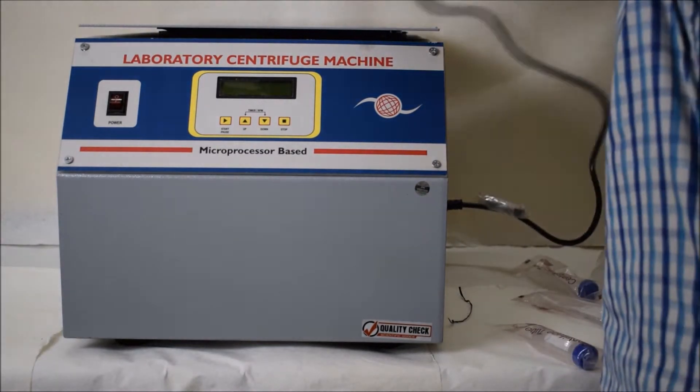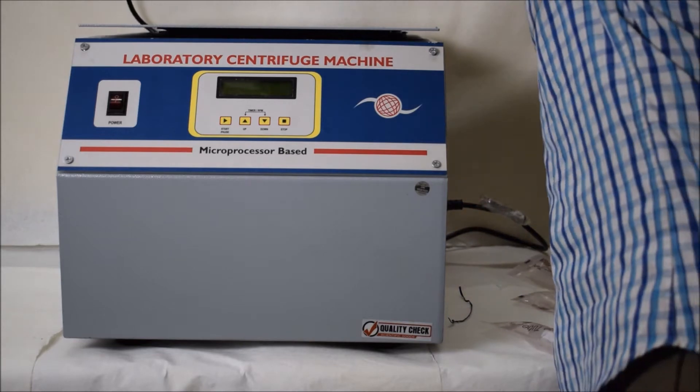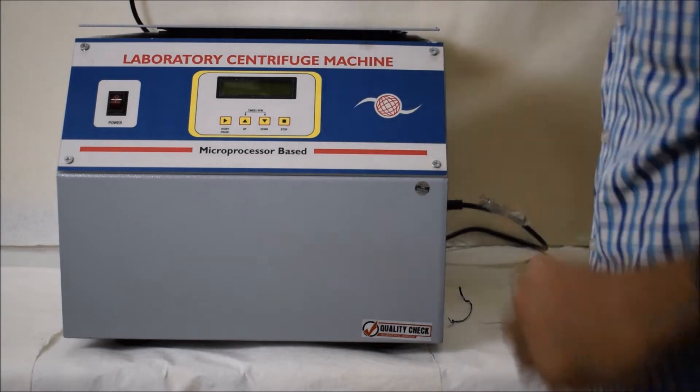Always keep in mind that when you are plugging the device, the power button on the machine should be switched off.